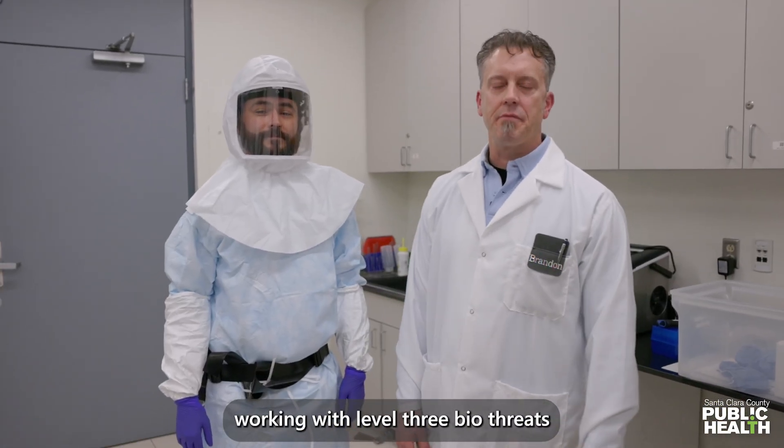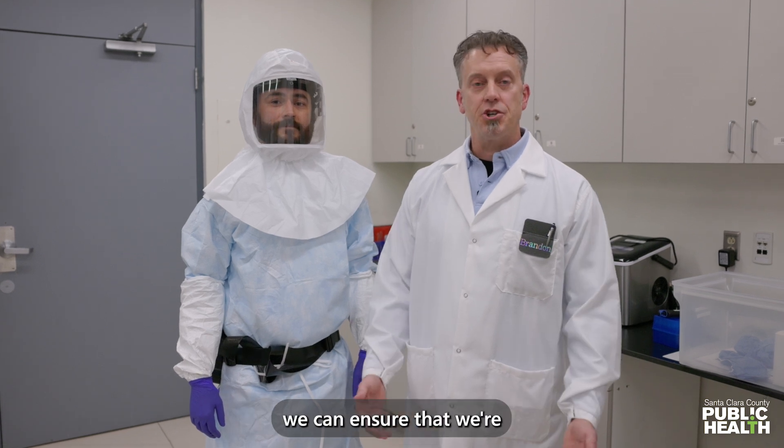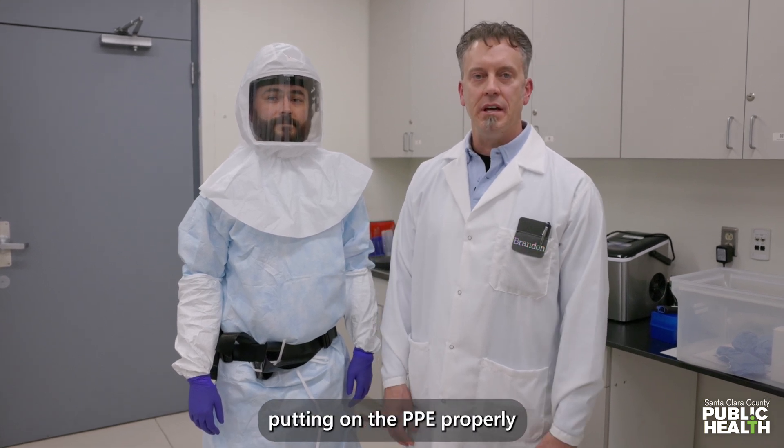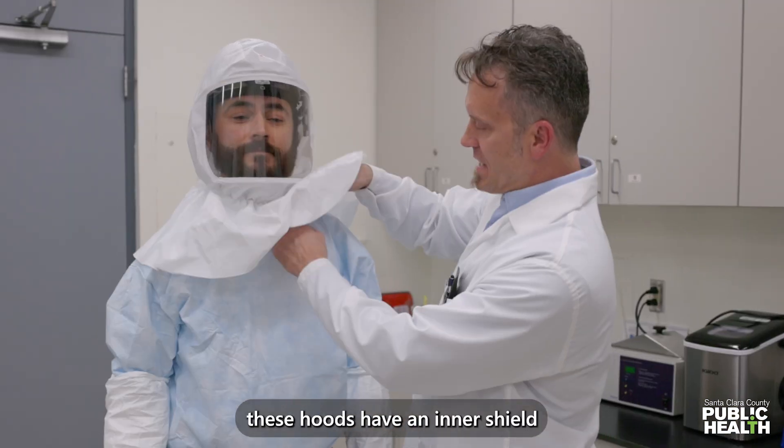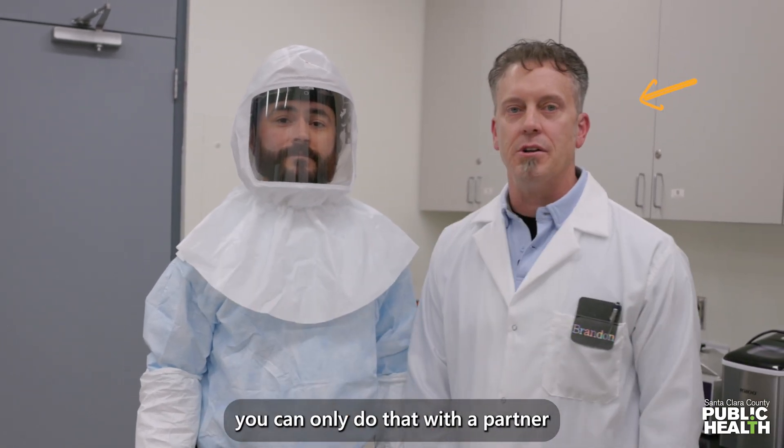Normally when we're working with level three biothreats, we work in teams, and one of the reasons we do that is we can ensure that we're putting on the PPE properly. One reason is these hoods have an inner shield, and we want to make sure that the inner shield is tucked into the gown — you can only do that with a partner.